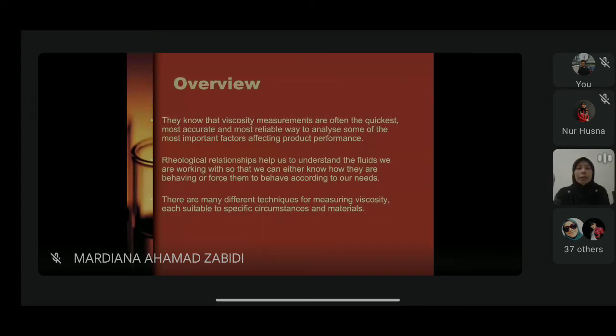Alright, but when you join big industries later, or those industries that are really concerned about the quality of their product, this viscosity measurement is one part that is critical for them to measure in order to make sure of the consistency of the product. Okay, so viscosity measurement is often the quickest, most accurate and reliable way to analyze some of the most important factors affecting product performance.